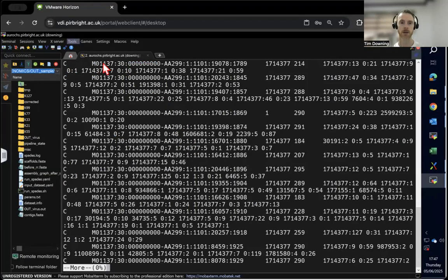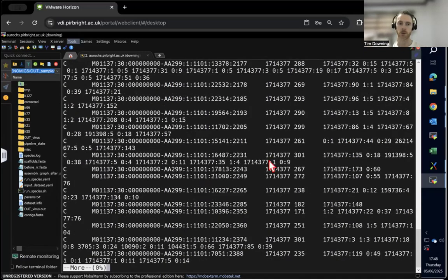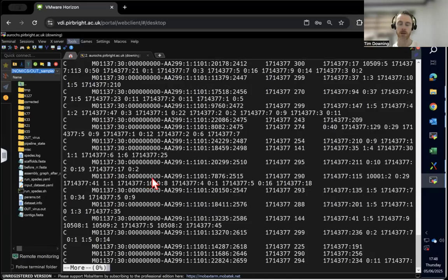So it's classified, that's the read identifier. Next you have the taxon. I mentioned this taxon ID already, and you see it has 13 matches. If we look further down, some matches are classified with other taxa, and so on. We can see through the report that there are different ones that are classified.